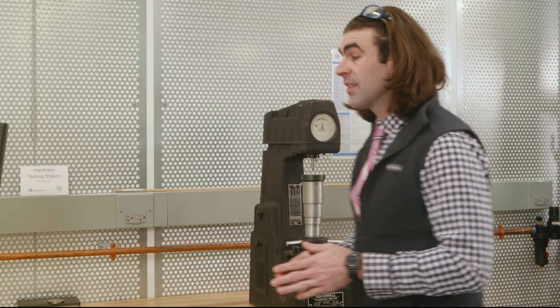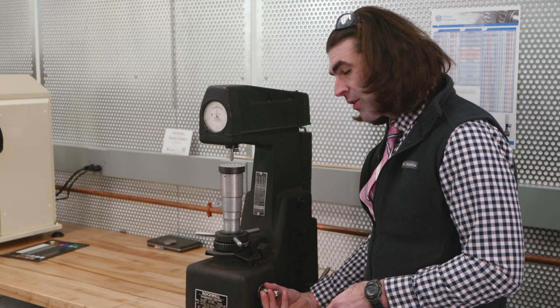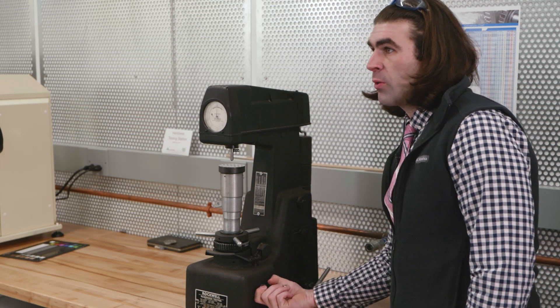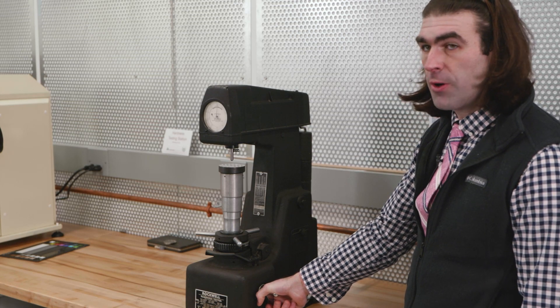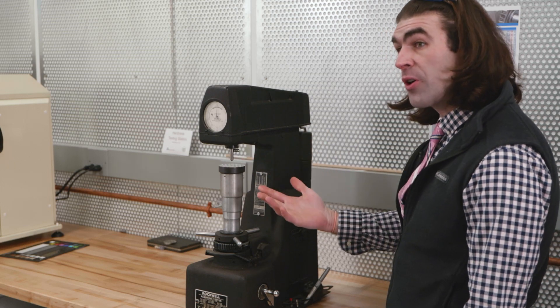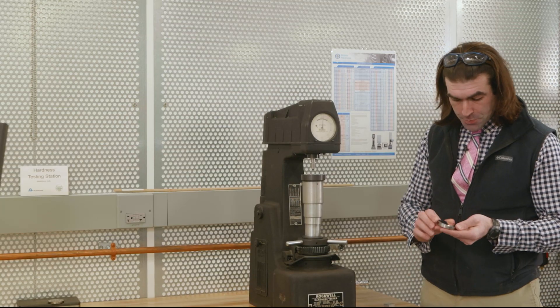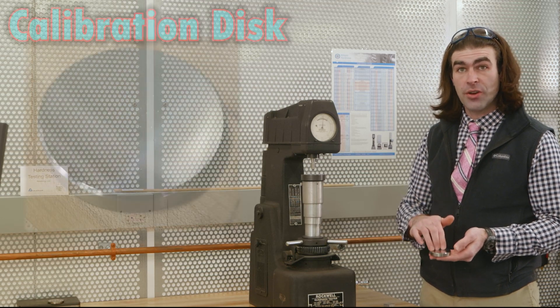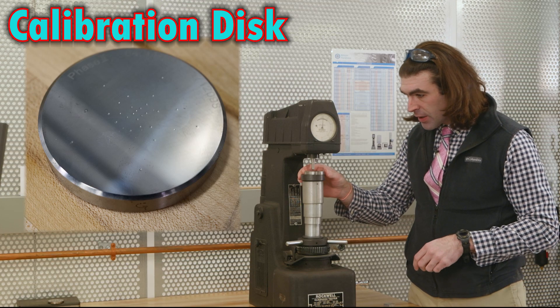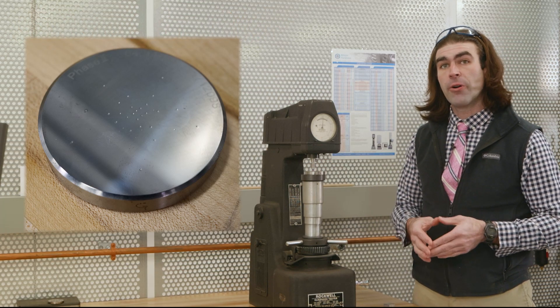We're set up for the C scale. The first thing you want to do when you approach the machine is make sure this handle is pulled back — it could be in the down position, so just pull it back toward you. Make sure we have the right weights and the right indenter. I'll grab a calibration disc with a known hardness value, clear off the table, and find a spot on the disc that hasn't already been tested.